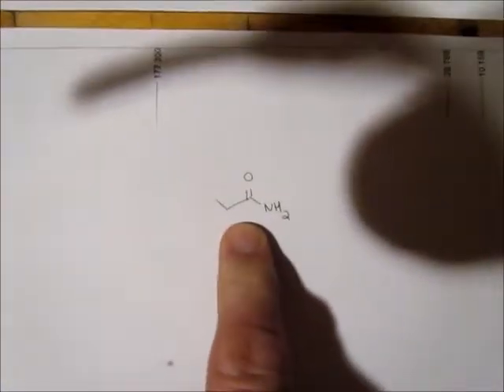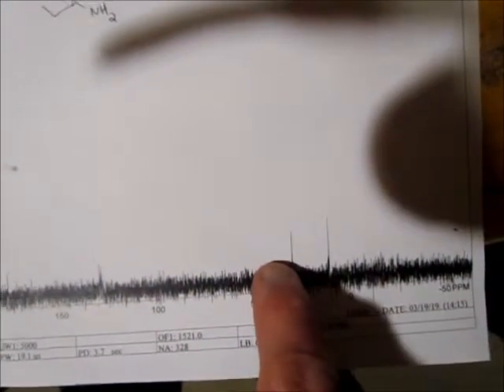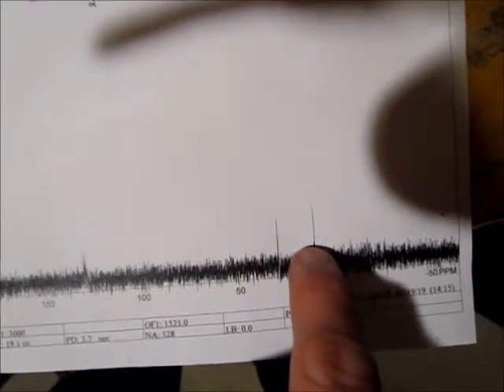The new one that we made, minus that methyl group, you're going to see 3 carbon signals. One of them is at 177, and then the other 2 are at 28. That's the CH2 group. The CH3 group is 10.1.